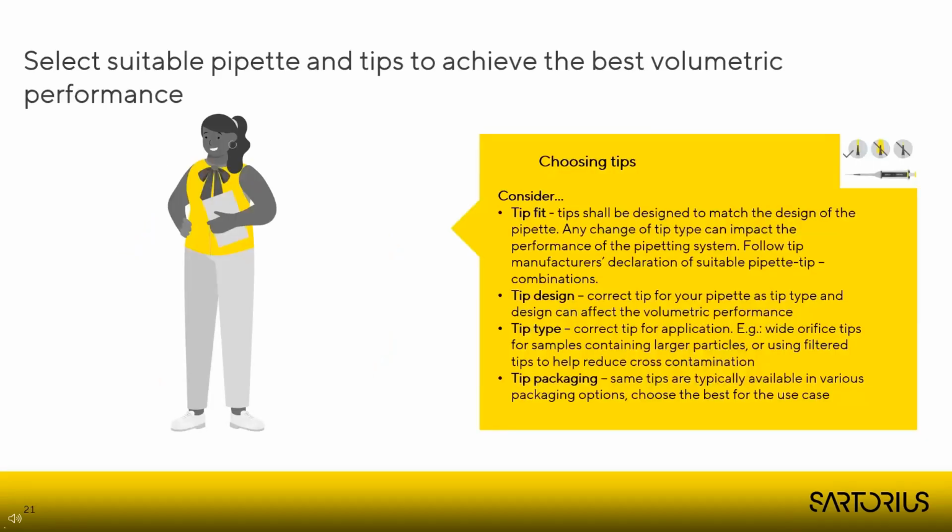Then to the pipette tips, which definitely are a very common consumable in a lab, and they can have a substantial impact on the lab's environmental footprint. For tip selection, I would consider a couple of things. The direct environmental impact: the manufacturing, transportation, and disposal. And then the indirect environmental impact, which might not be that obvious when choosing the tip, but definitely choosing the tip in a way that it doesn't impact the pipetting results and potential rework, similar to the pipette selection earlier.